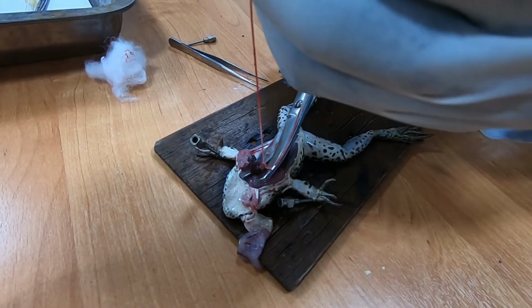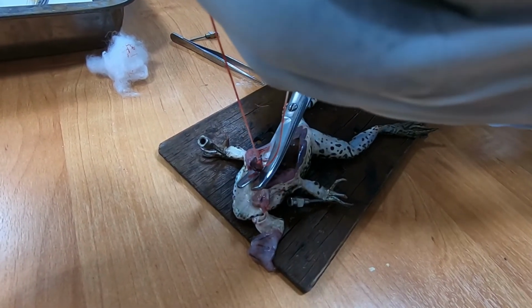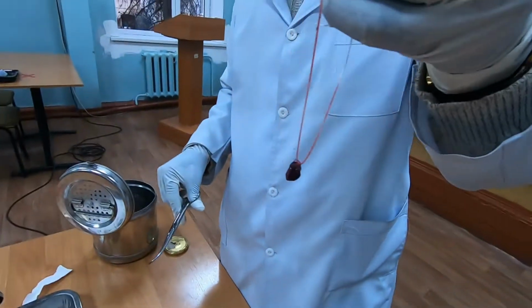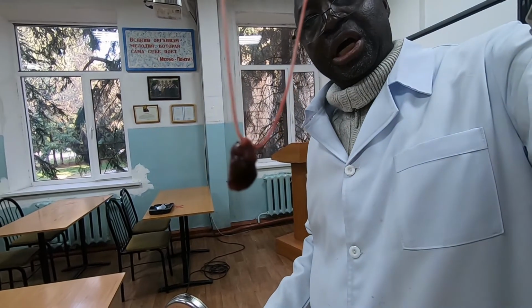We're going to isolate the heart. We have isolated the heart.